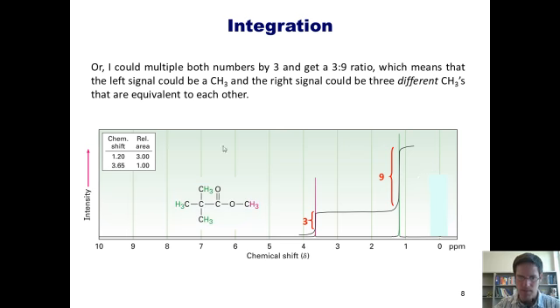Here it is. So you'll notice that this CH3 right here corresponds to this peak right here in pink. And these 9 hydrogens here are all equivalent. So they give one peak right here that corresponds to 9 relative to this peak's height.